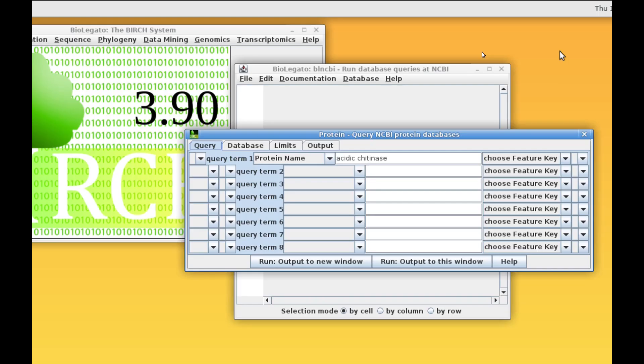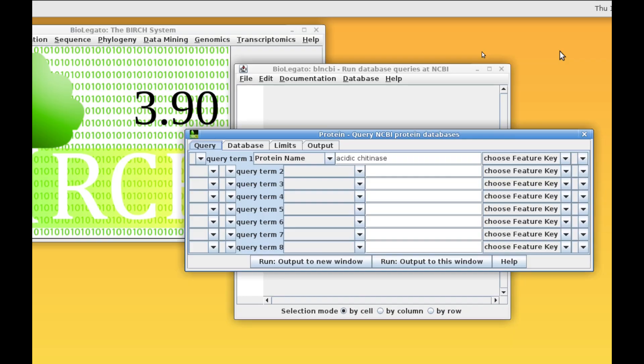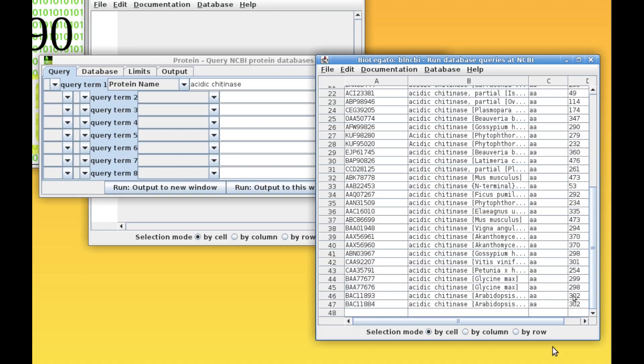For example, BLNCBI allows you to retrieve protein sequences from the NCBI database using keyword searches. So here, if we search for the term acidic chitinase, we will then be able to get hits that contain those sequences. The resultant sequences pop up in a new BLNCBI window, and then we can retrieve the proteins directly from this step.